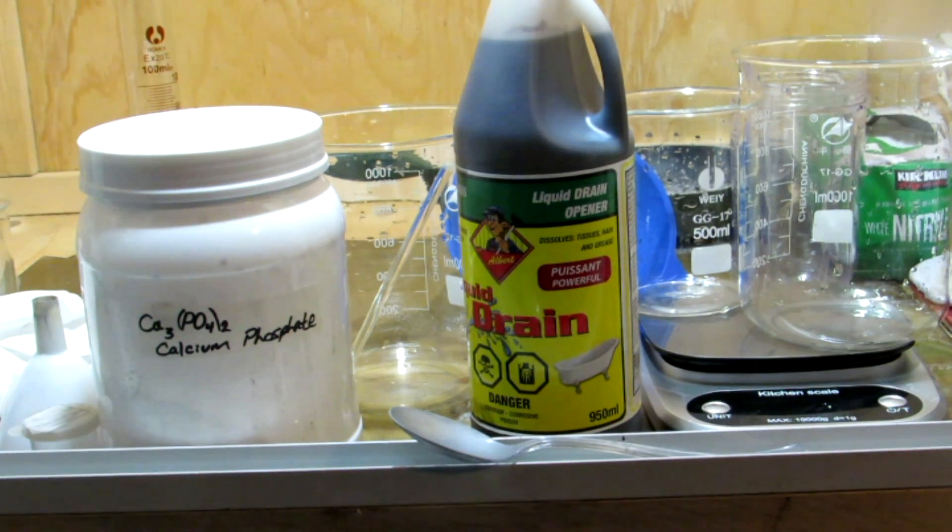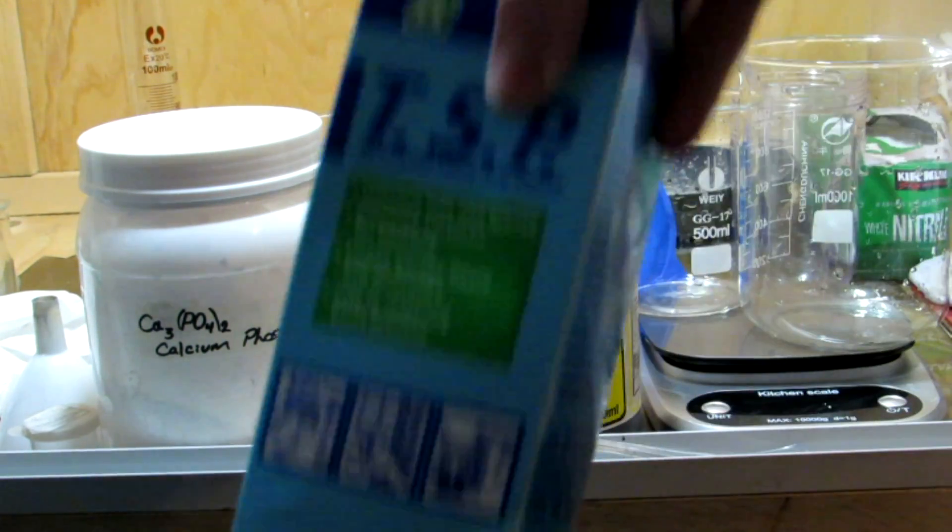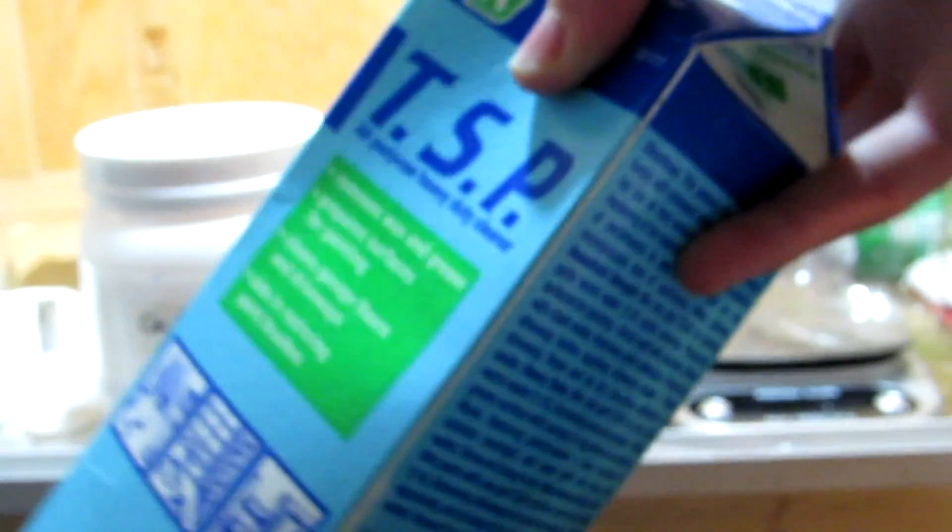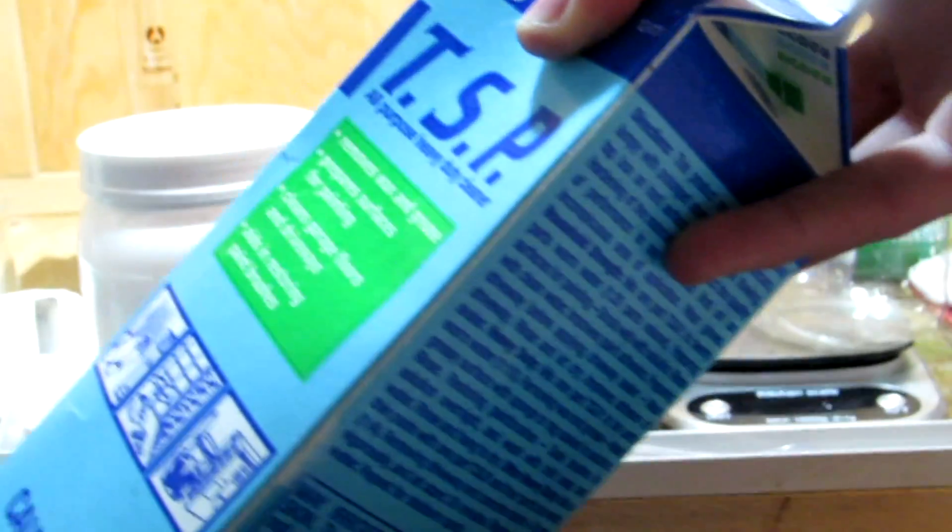Sodium hydroxide can be purchased at hardware stores such as Home Hardware and sold as lye, and you can also find it in some drain cleaners. Calcium phosphate can either be purchased from a pottery supply store or you can make it yourself from trisodium phosphate, which is TSP cleaner, and calcium chloride.